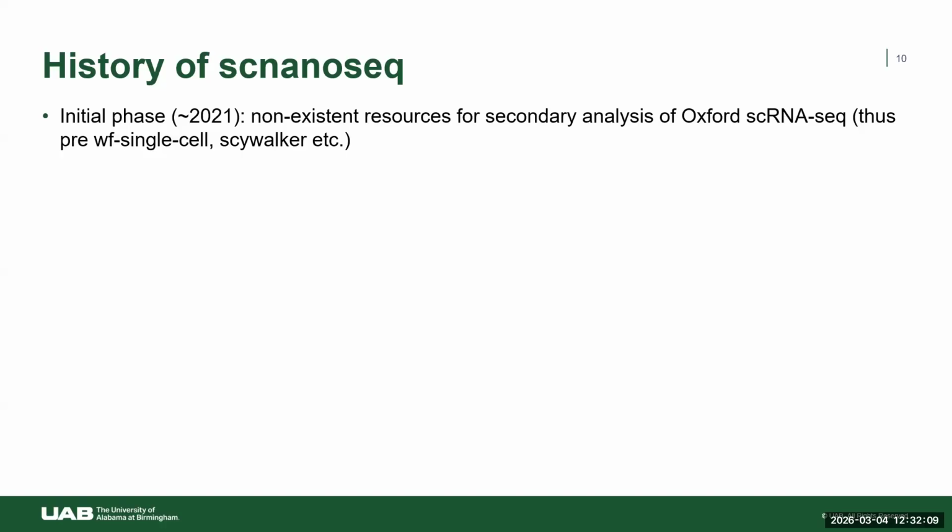Up until this point, the only way that researchers did single-cell analysis with long-read technology was to pair long-read with short-read, because they needed the short-read data to essentially validate their long-read data and actually help correct it. But as you can imagine, that's very expensive. That can add up very quickly. And on the data analysis side, that's processed very differently.